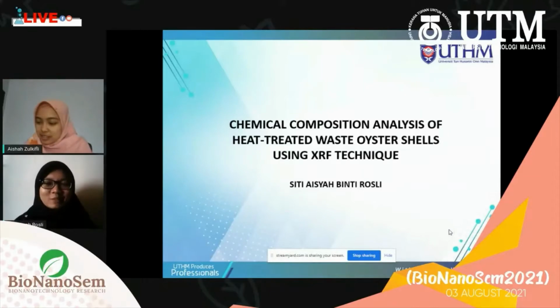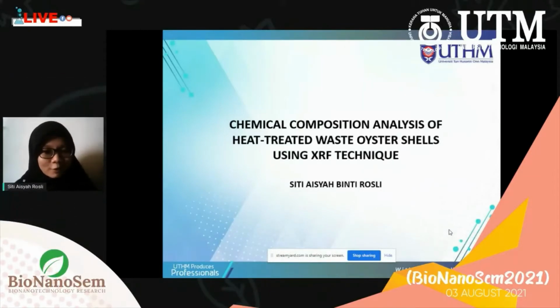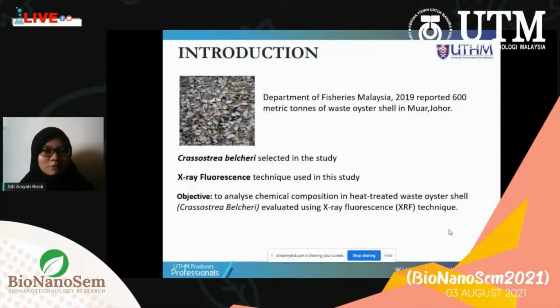My name is Siti Aisyah Rosli. I am a student from University Tun Hussein Onn Malaysia, and today I would like to present chemical composition analysis of heat-treated waste oyster shells using XRF techniques. This is the brief introduction to our problem statement.